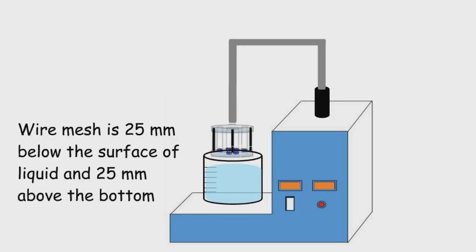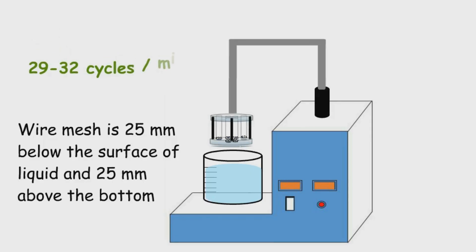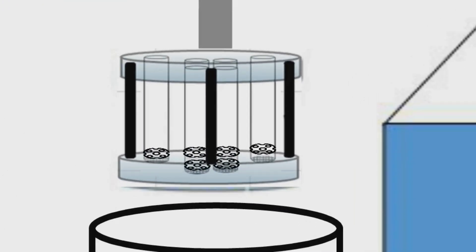The basket rack assembly moves up and down at a rate of 29 to 32 cycles per minute. The test is continued until all the tablets in all six tubes disintegrate and pass through the wire mesh into the beaker.